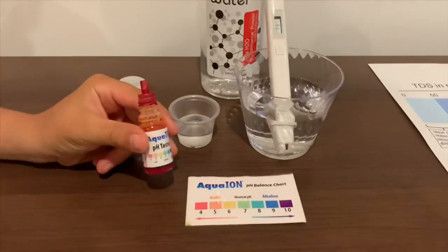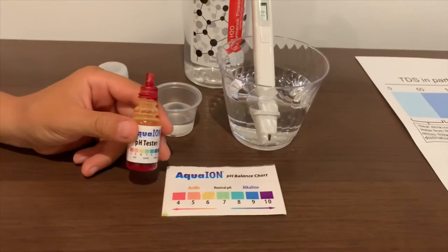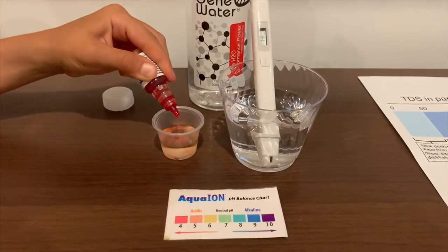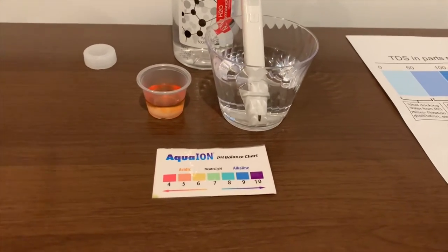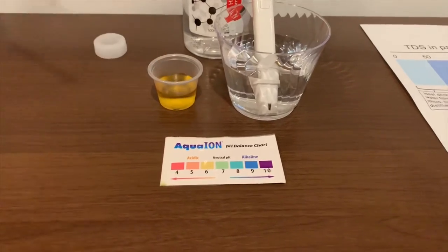Now let's test the pH level. If you want to buy this pH tester, check the link down below. Only do two drops. Let's stir it a little for a better result. I'll give this a 6.